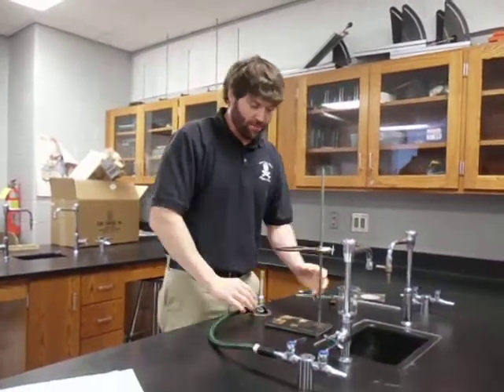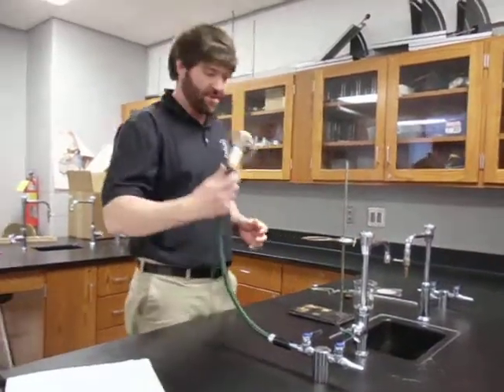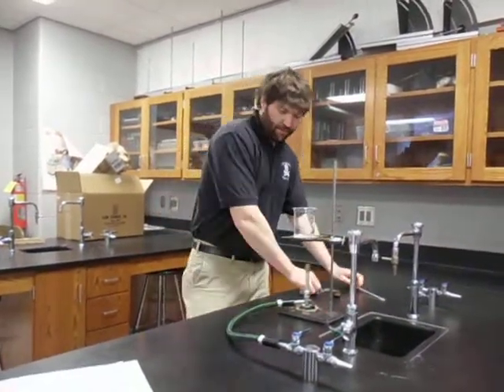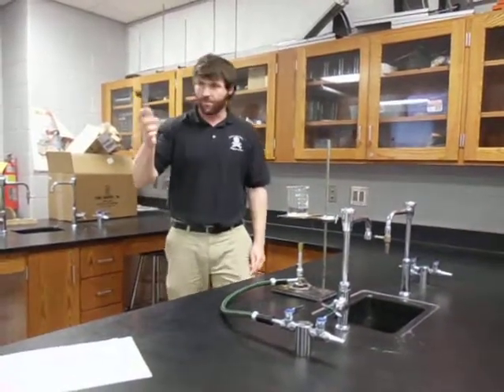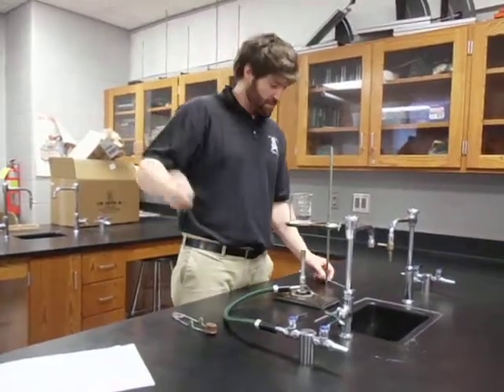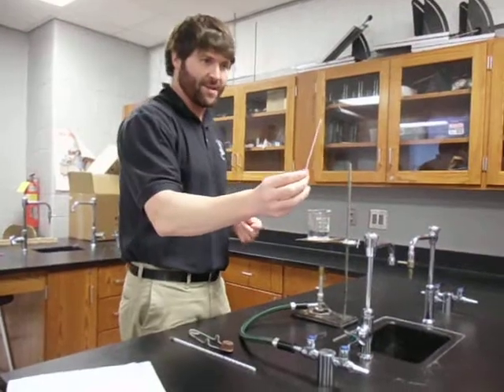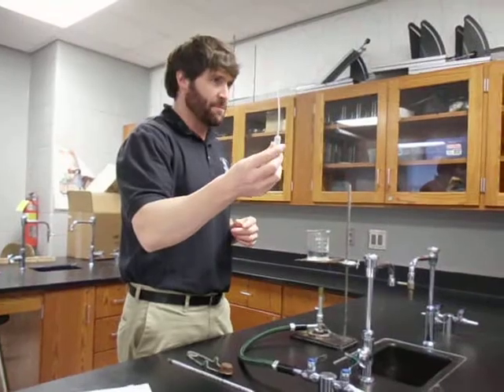We don't need much — this lab's pretty simple. We're going to need our ring stand, a Bunsen burner set up, wire gauze, and a beaker. Pretty much these are things you've got in your drawer. We'll also need a striker, a thermometer, and the extra special thing we need is a thin stem pipette — it's got a little bit of moisture inside of it.